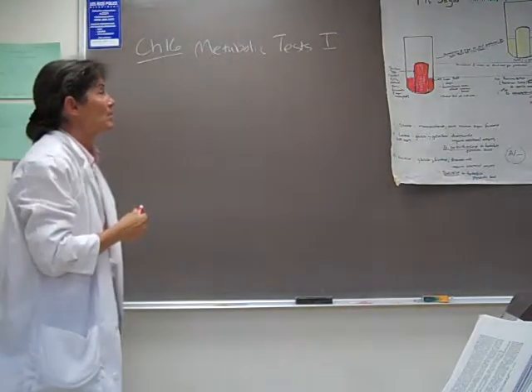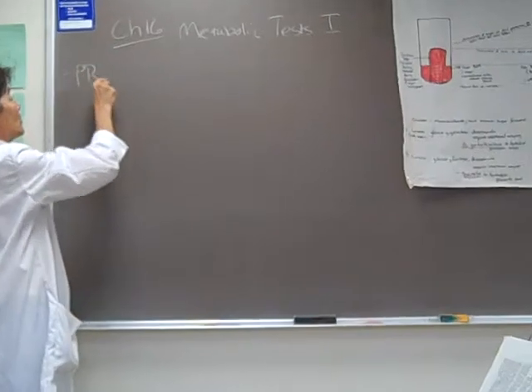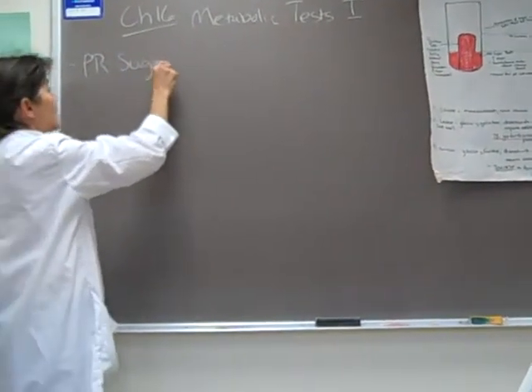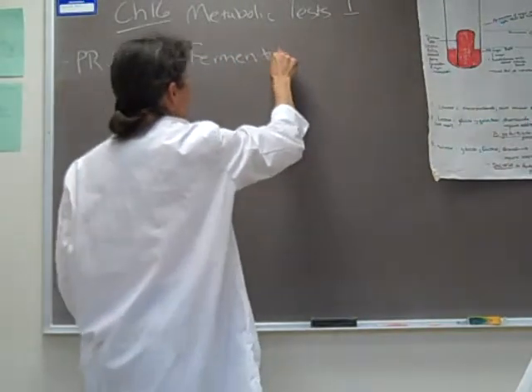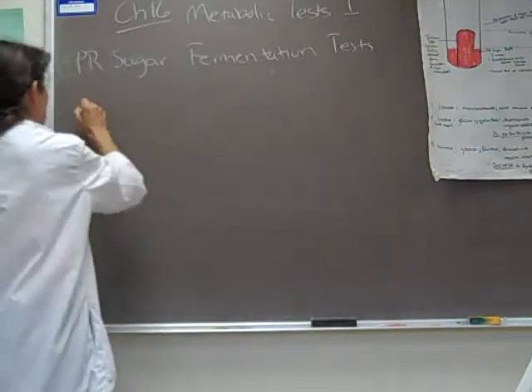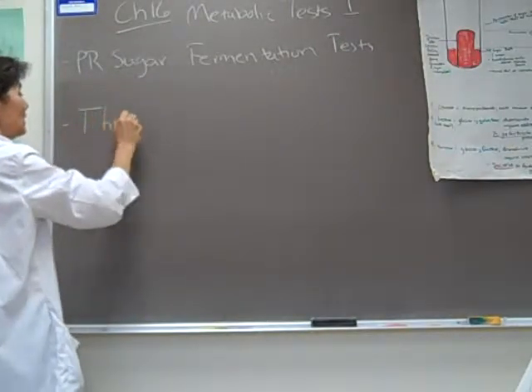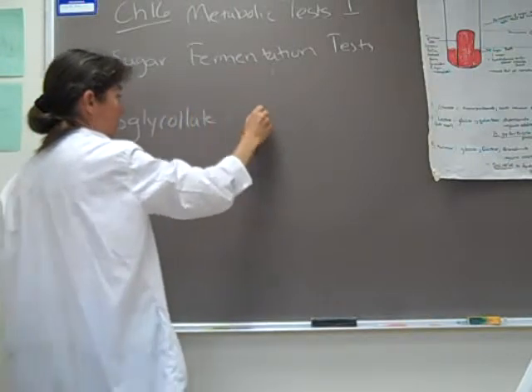And the 3 metabolic tests we're going to introduce you to today are the PR sugar fermentation tests, the thioglycolate test for anaerobic growth.